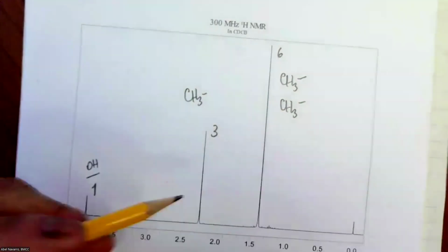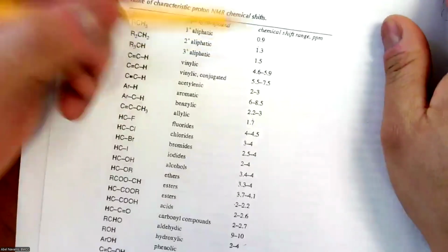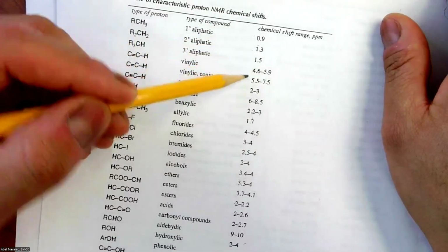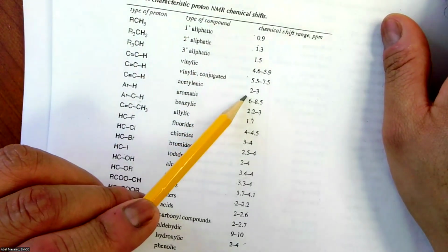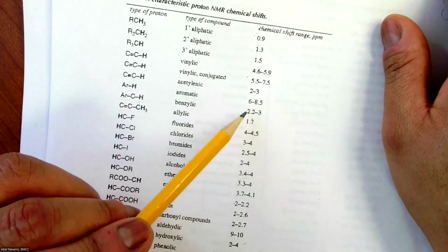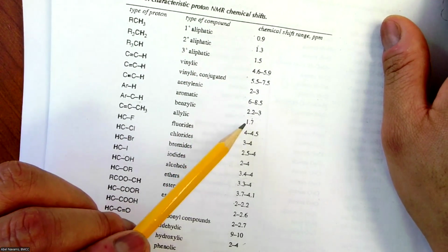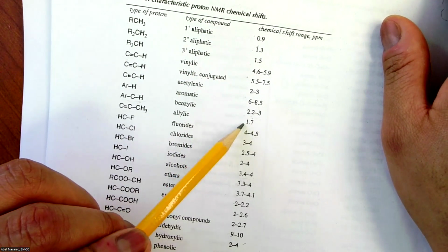So that CH3, right, is around 2 ppms. What peak is around 2 ppms? No, no triple bond. I don't have enough DUs. Benzylic, no, because I don't have enough unsaturations. Allylic, no, I don't have CCC. I already have my COO.